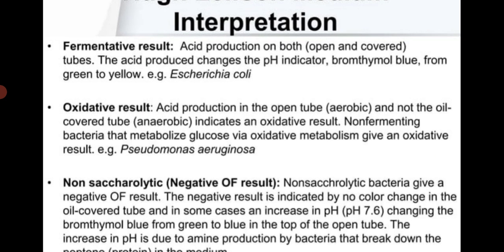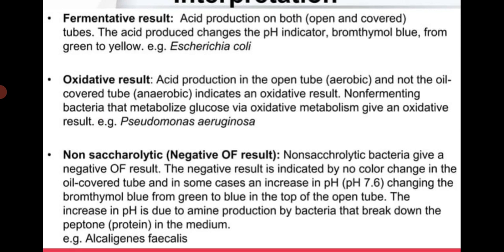Fermentative result: acid production in both tubes (open and covered) — the acid changes bromothymol blue from green to yellow; e.g., Escherichia coli. Oxidative result: acid production in the open tube only, not in the oil-covered (anaerobic) tube, indicates oxidative metabolism; e.g., Pseudomonas aeruginosa. Non-sacrolytic or negative OF result: non-sacrolytic bacteria give a negative result — no color change in the oil-covered tube, and sometimes an increase in pH changes bromothymol blue from green to blue at the top of the open tube due to alkaline production from peptone breakdown; e.g., Alcaligenes faecalis.